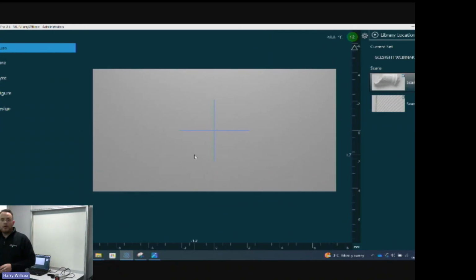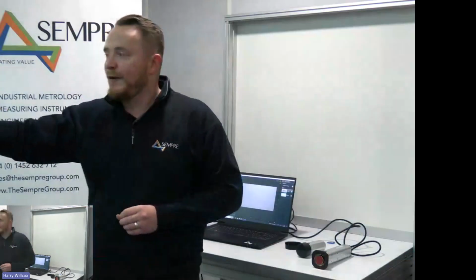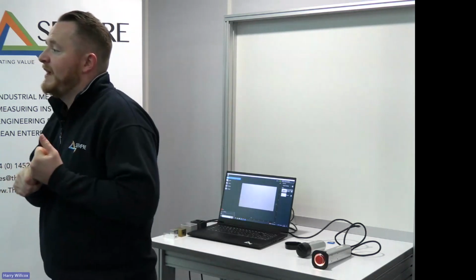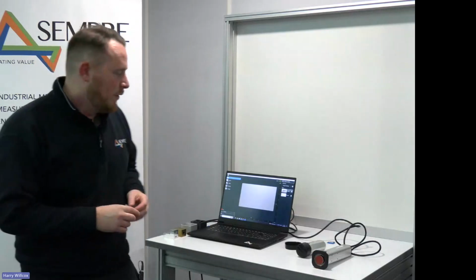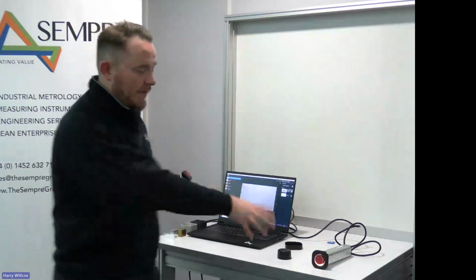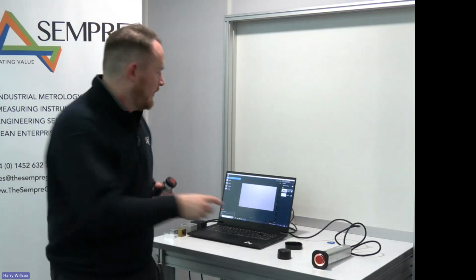Okay, so on the right hand side of me here, I'm not looking away. I've got the questions all pulled up on the team, so I'm just going to read them out so that everyone knows which one I'm working on. So what is the field of view, and can composite images be made? The field of view on the Gelsight Series 2 is 16 millimeters by 14 millimeters. And on the Gelsight Max, it's 15.5 millimeters by 8.8 millimeters. So that's the field of view that we can see.